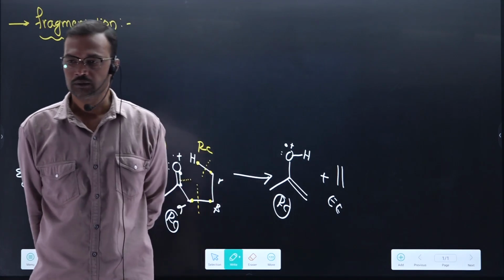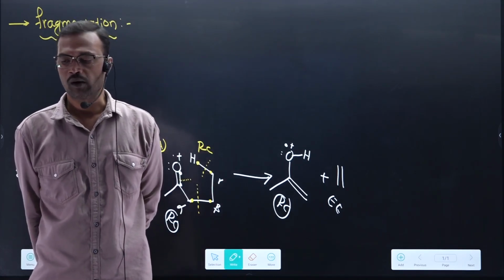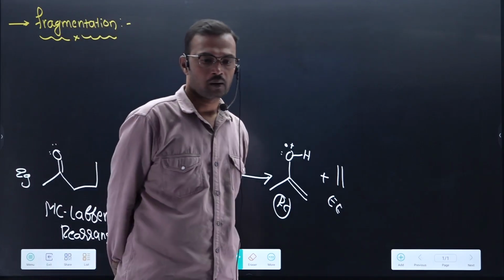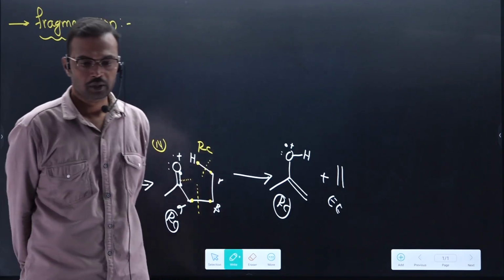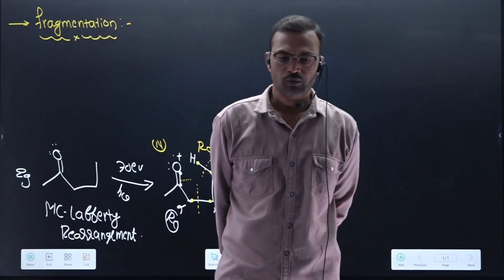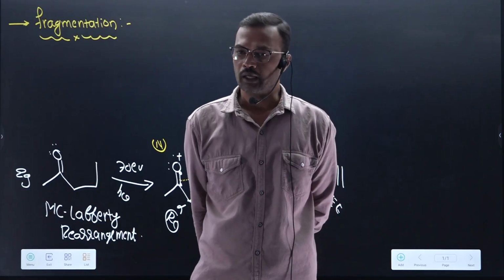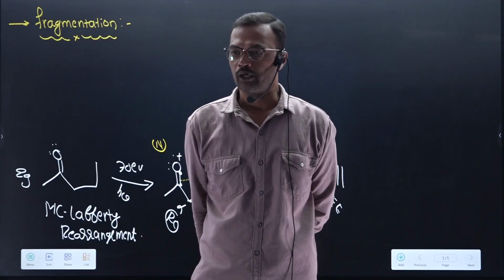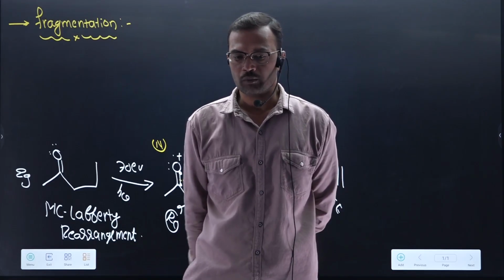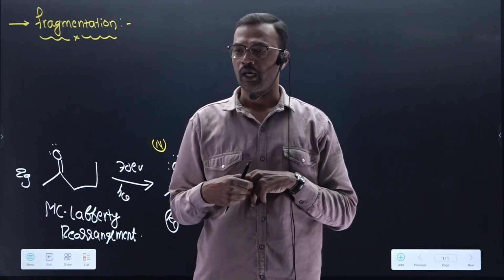Next point. Fragmentation leads to formation of radical, cation, anion, etc.